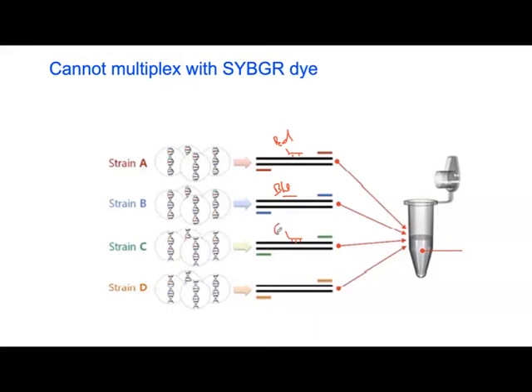This one is, for example, green, and this is a lighter yellow color. So you design a probe for each strain, you need 2 primers and a probe that specifically binds to strain A. During the PCR, because the machine has a different filter for each color, you can measure all the products in one single tube, and it gives you an answer.